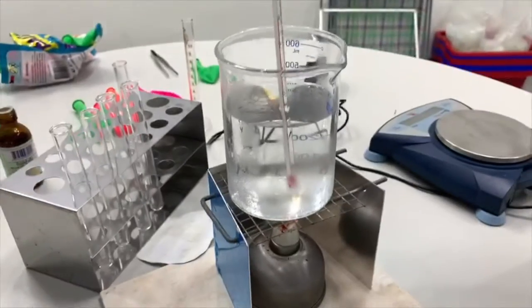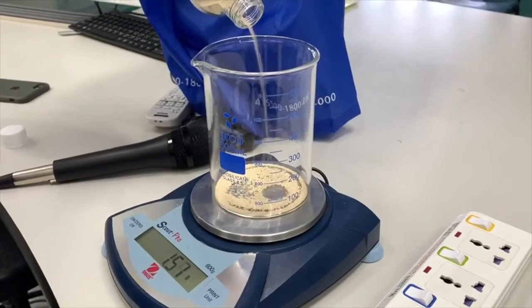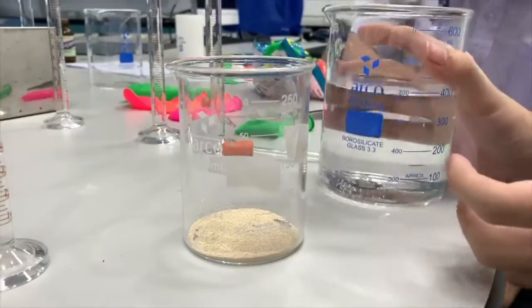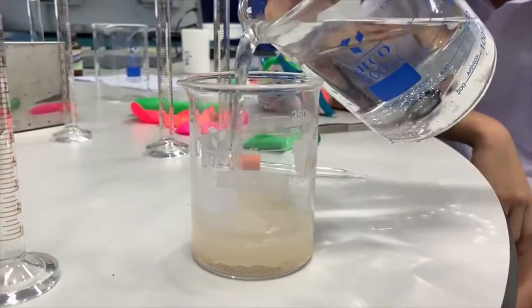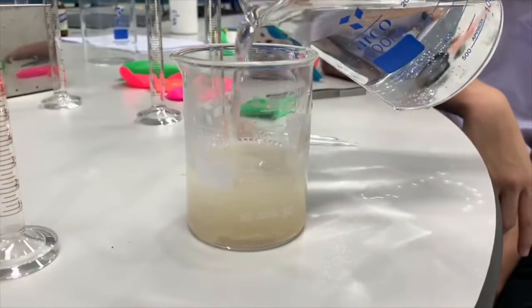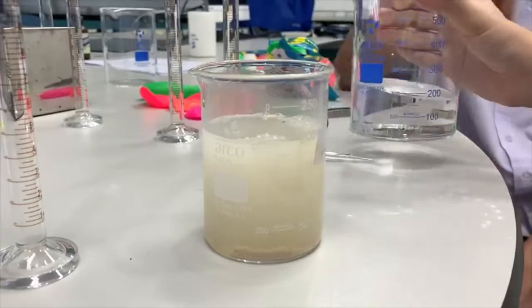The objective for these experiments is to observe and compare the amount of carbon dioxide produced by different amounts of yeast in the same amount of glucose solution. Next is hypothesis. We think that the test tube which has the most yeast can make the balloon wider than another.